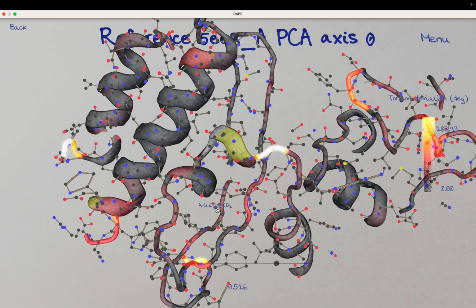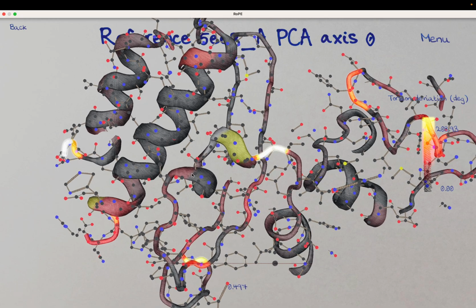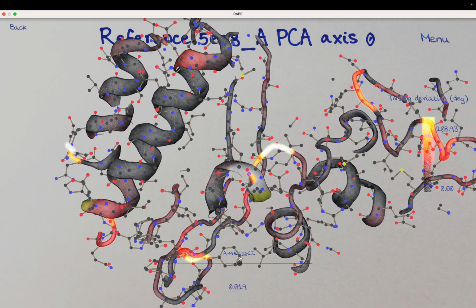There we go. So now we want to have a look at what is changing most severely in this region, so that we can see what the effect of this is across the entire range of protein structures. In this case, I would say that the backbone of residue 219 and the backbone of residue 214 are exhibiting the most variation here in terms of the distance between the two atoms. Those are the residues which are varying the most aggressively. So now let's use that information and see what the effect of that change is across all of the structures.